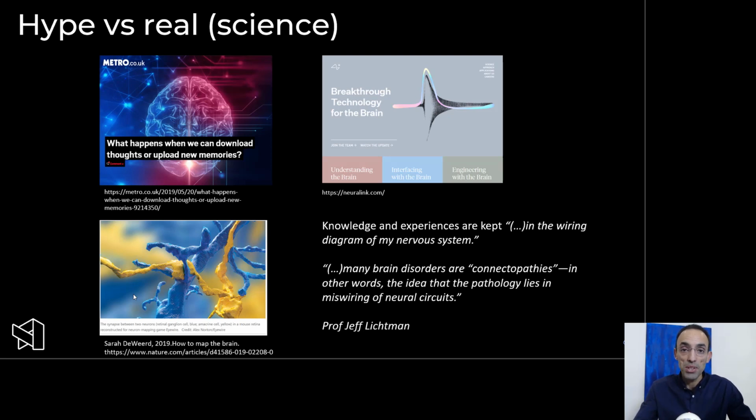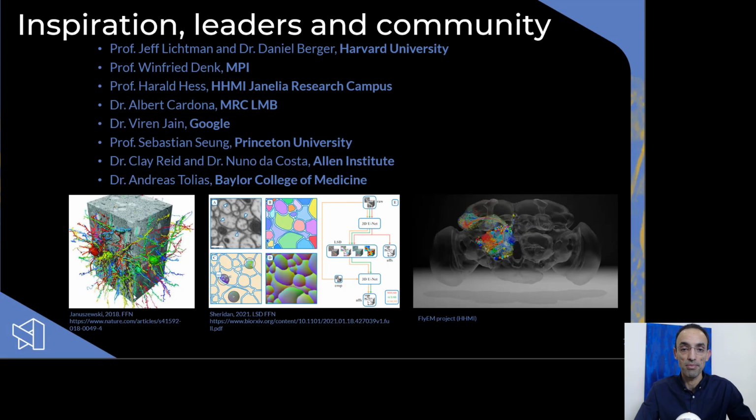On the other hand, understanding the wiring may also give us insight into how we learn and how memories are kept in our brain. So these are really broad questions, very interesting and very impactful to our humanity. And so this is certainly a very worthy cause to pursue. There are a number of outstanding research groups working on this topic already for quite some time, especially in the last 10 years with the advancement of particular microscopy techniques and also software that we'll mention in a moment.